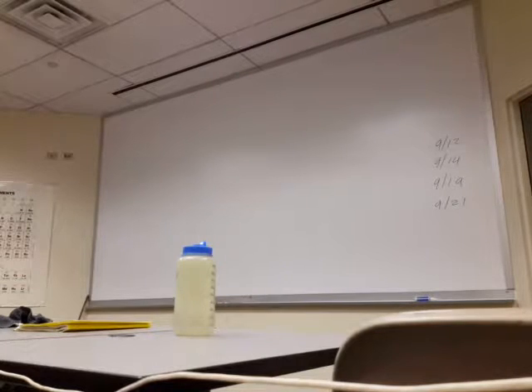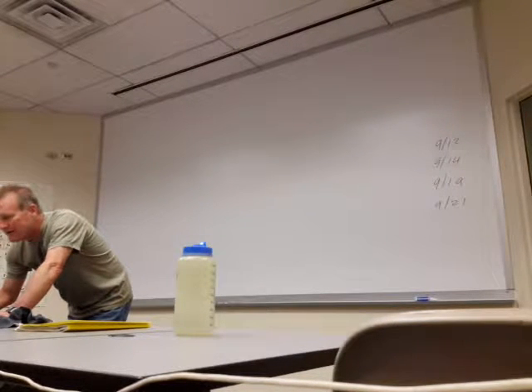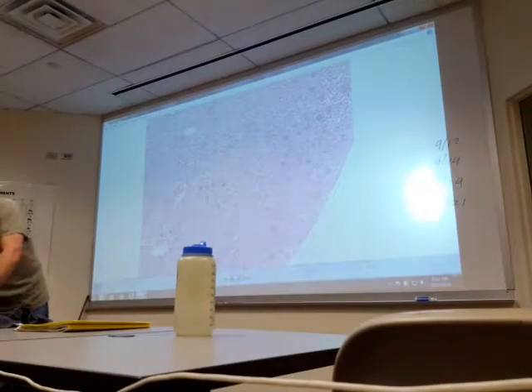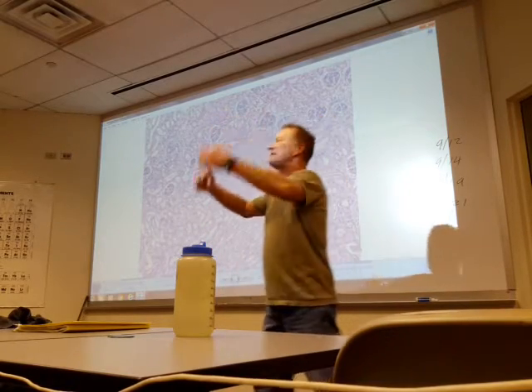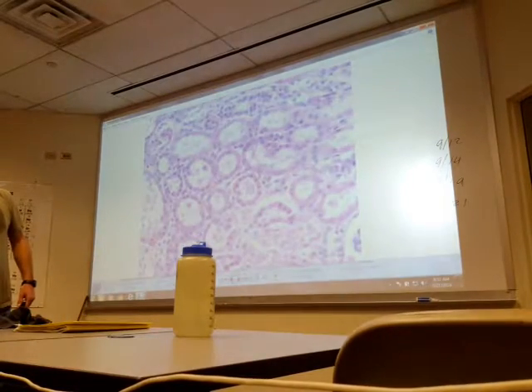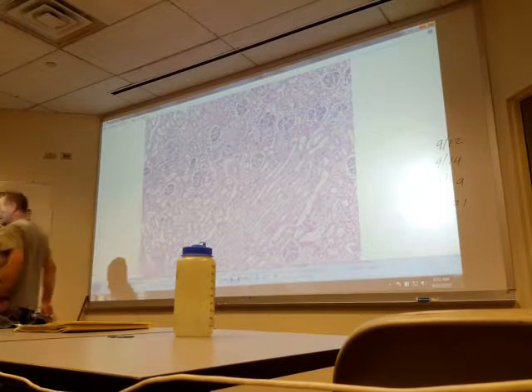In other words, here's the order. You look at that very first picture of the kidney. That's when your brain identifies it, and you say, oh, that's kidney. It might not be this low, it might be the next one, but your brain says, oh, that's kidney. And then everything you've learned from the higher magnification slides and from listening to the DVD races through your brain. So you say, for example, oh, that's kidney.